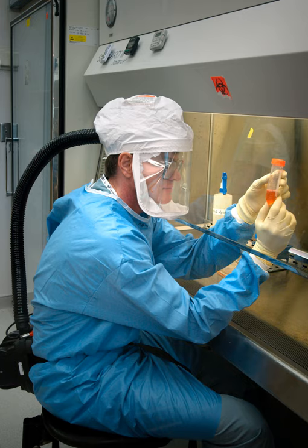Principles of operation: Class II cabinets use motor-driven blowers, fans, mounted in the cabinet to draw directional mass airflow around the user and into the air grill, protecting the operator. The air is then drawn underneath the work surface and back up to the top of the cabinet where it passes through the HEPA filters. A column of HEPA-filtered, sterile air is also blown downward, over products and processes to prevent contamination.